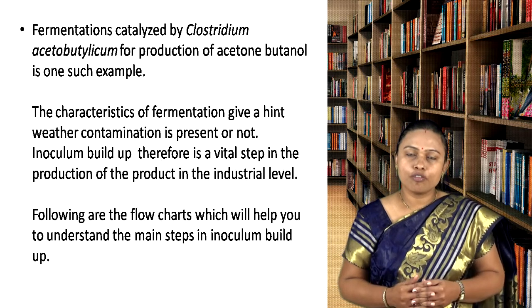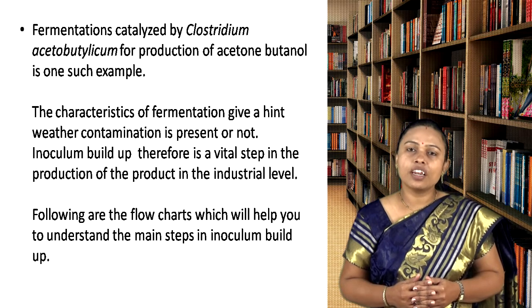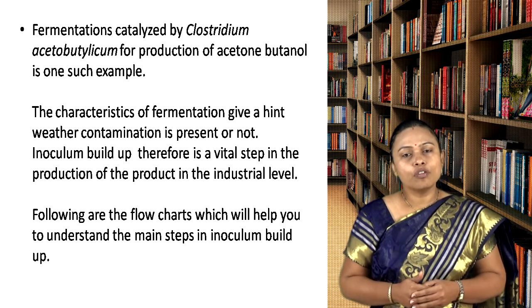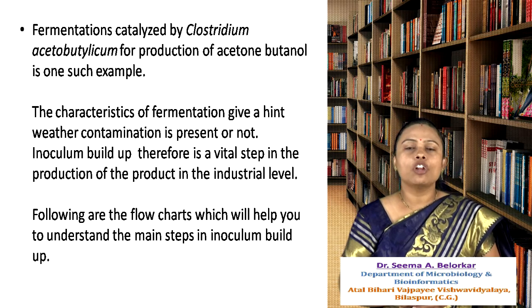Inoculum buildup, therefore, is a vital step in the production of the product at the industrial level. Following are the flow charts which will help you to understand the main steps in inoculum buildup.